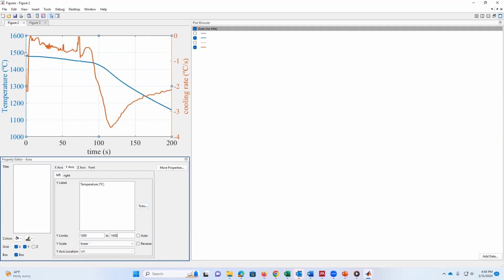So clearly you'll see here where the solidification starts, and I can create this data tip. Okay. Solidification point start on the blue line. So when this derivative changes at approximately this value, we have our liquidus point. So the material starts to solidify. That's the liquidus, the liquidus starts to form. We have a particular kind of thermal arrest, or so. We have a small bump here that could be a small phase transformation, but mostly our liquidus temperature starts approximately at this point where the derivative changes. So we're saying that the liquidus was approximately at 1475 and the solidus approximately at 1439, 1435, something like that.